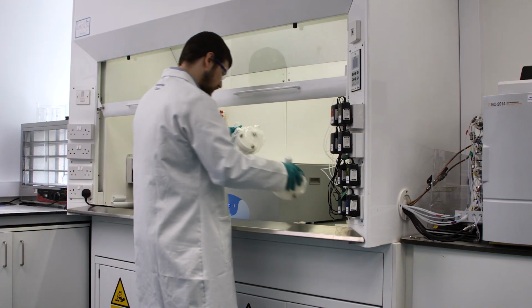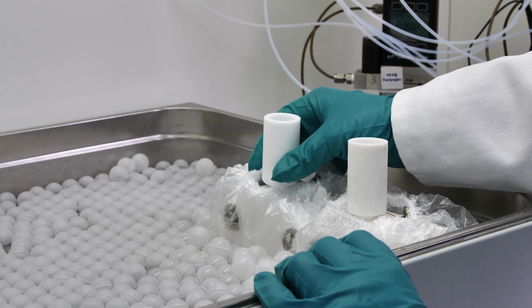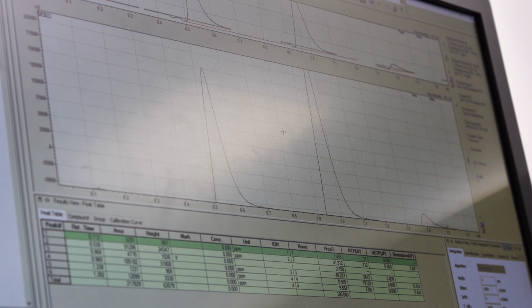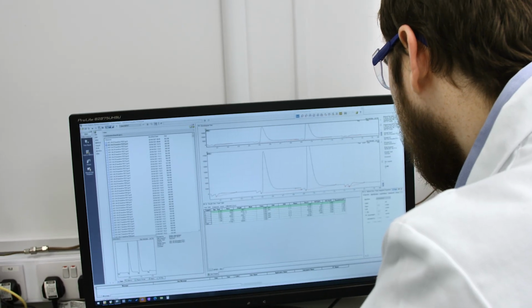The main difference between the GCFID and other detection techniques like electrical conductivity is, although they work on the same general principle of testing, they differ in the types of chemical they can detect. So electrical conductivity can detect non-volatile chemicals, whereas the flame ionising detector can detect volatiles. What we mean by this is it can detect any chemical that can readily evaporate. So after a chemical has permeated the fabric, it'll evaporate into the nitrogen stream and this will be taken away to the detector for quantification.